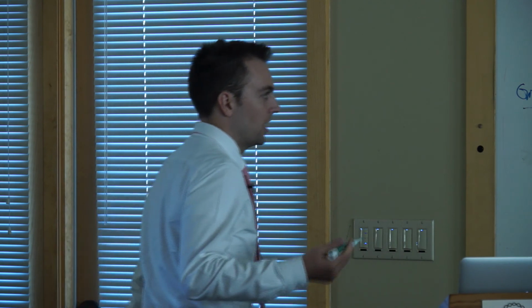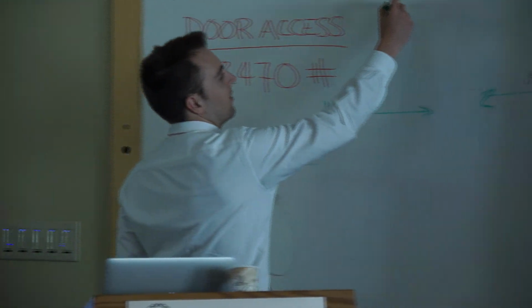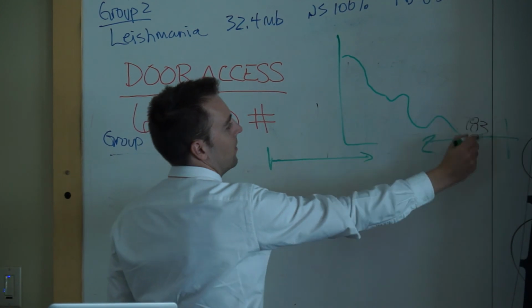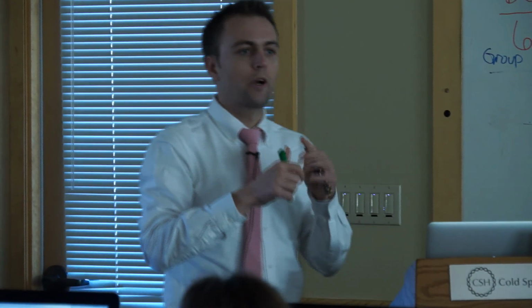And one of the first things you can do is to look at the distribution of that fragment length, which was the chart that Olivier showed. And if anyone's interested in the code to do that, it's pretty simple. I'm happy to email it to you. But it gives you this sort of distribution of reads corresponding to distances of nucleosomes apart from one another, right?